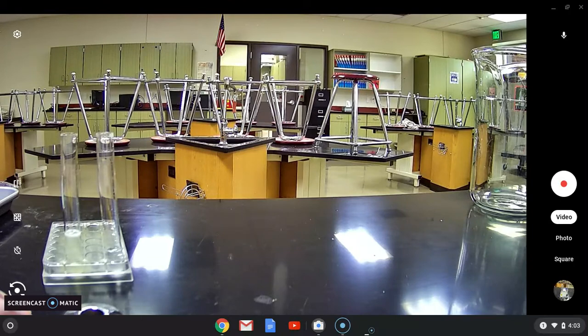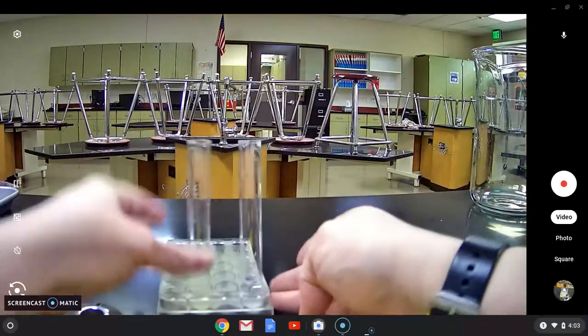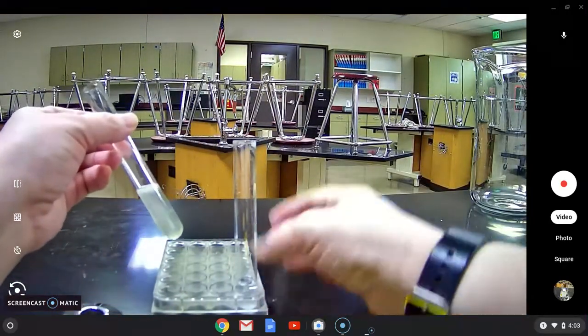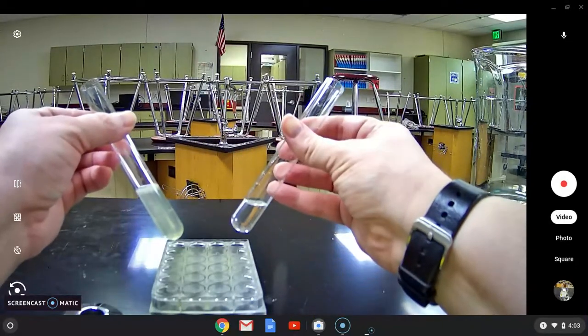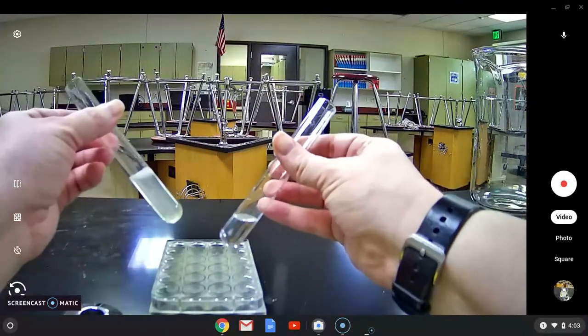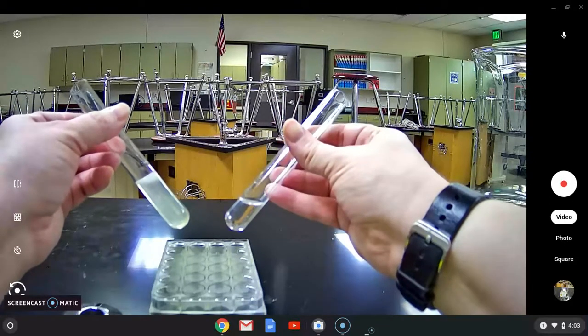So in this particular one I have a protein solution and plain water so that you can see a positive and negative test for the presence of protein.